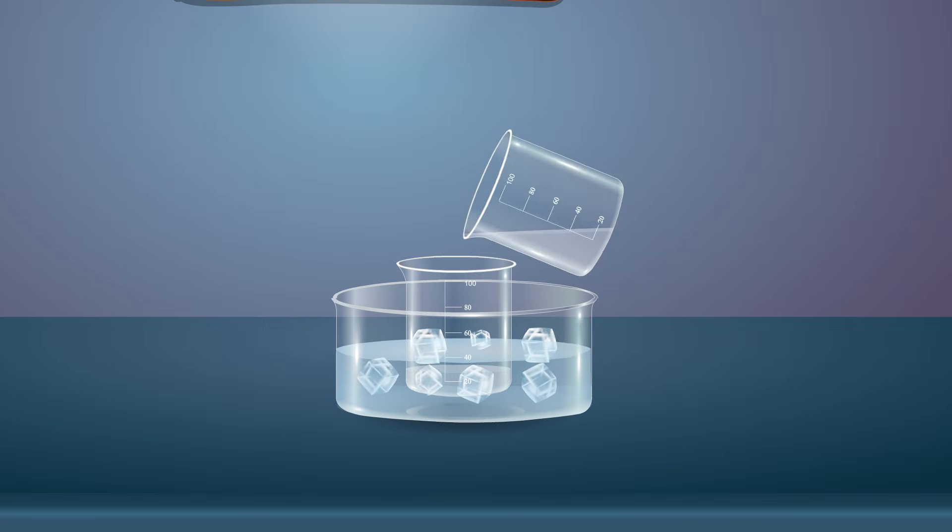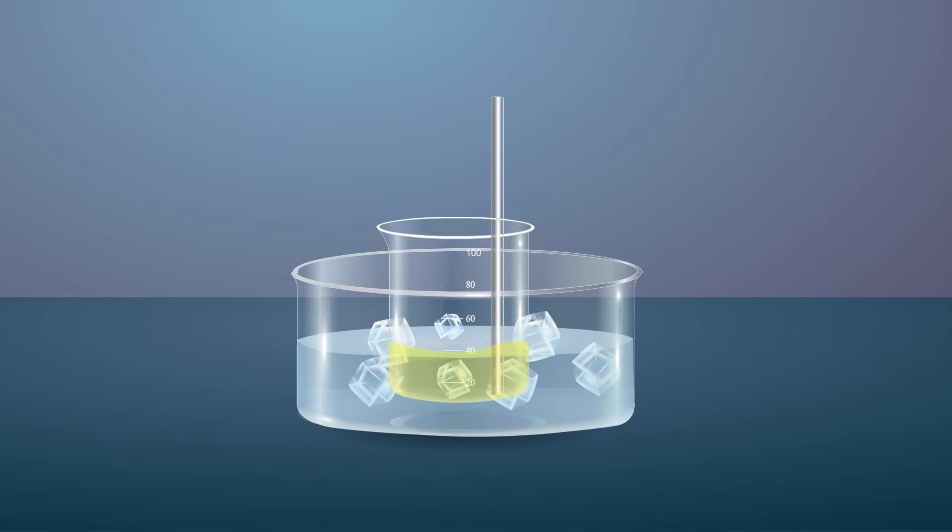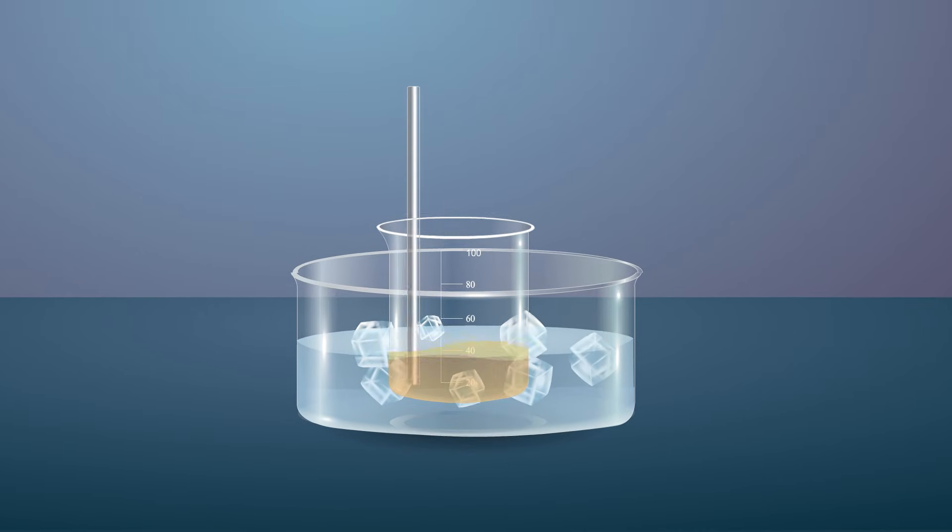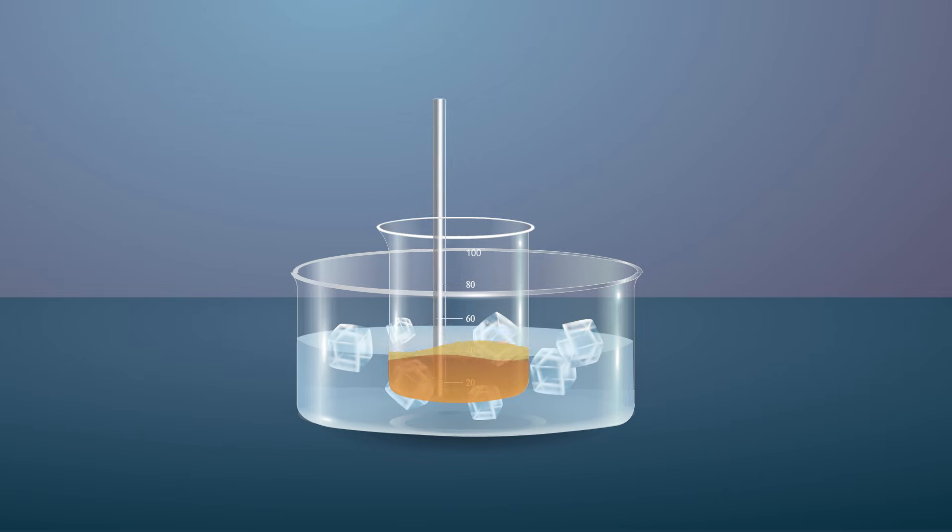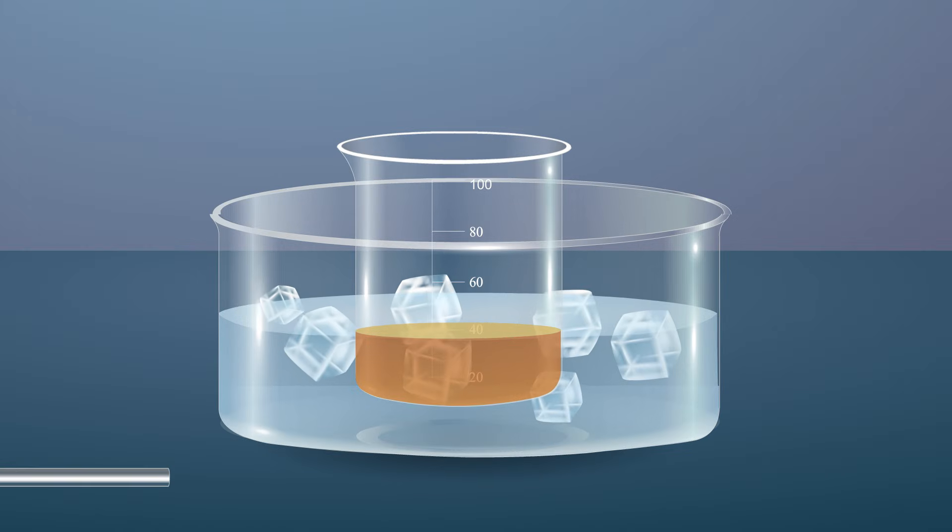Add this sodium nitrite solution to the above mixture with constant stirring with a glass rod. Diazotization takes place and benzene diazonium is formed, yellow to dark brown color.